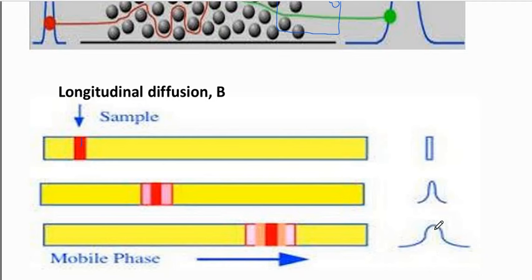Bear in mind, if the peak broadens, it leads to poor resolution between two adjacent peaks. If I have this particular peak and another one which is very close to it, that one may overlap on this one because this one has spreading. At the beginning it will look like this for different peaks, but when it widens, it will overlap on the new peak, and this will lead to poor resolution. So that is for the longitudinal diffusion, for just longitudinal movement or expansion of the analyte.